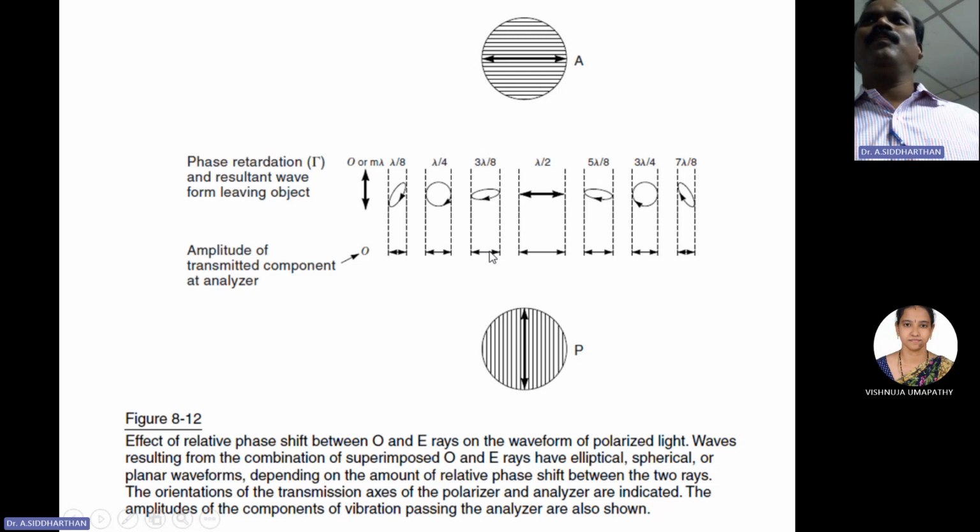difference in intensity. Now, as in phase contrast microscopy, if I put a polarizer and analyzer in, the features corresponding to this difference in O and E will be revealed by intensity contrast of this magnitude. So, if a sample exhibits these characteristics, that can be utilized to see the features of the sample. Without analyzer and polarizer, it is simply a bright field.